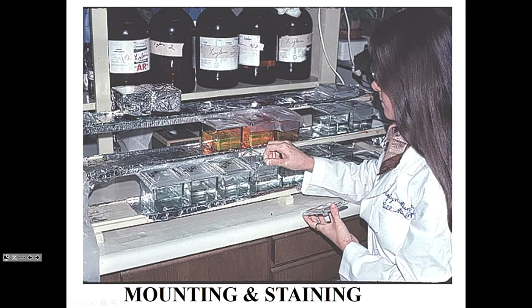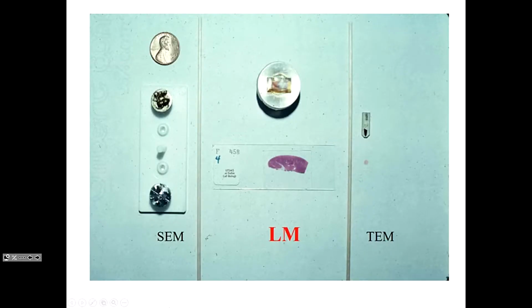Then you let it cool, and then you pass it through a series of solutions, starting with xylene, then ethanol, and then eventually dyes. And these dyes allow us to see different structures within the cells and tissues. Okay, so that's light microscopy.